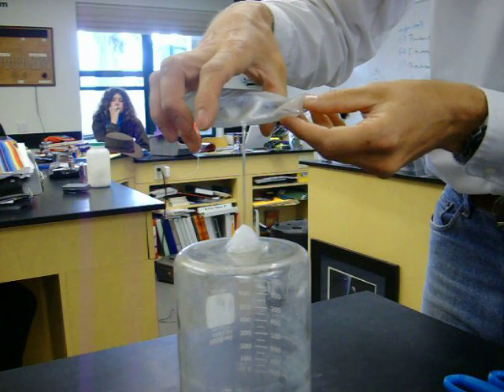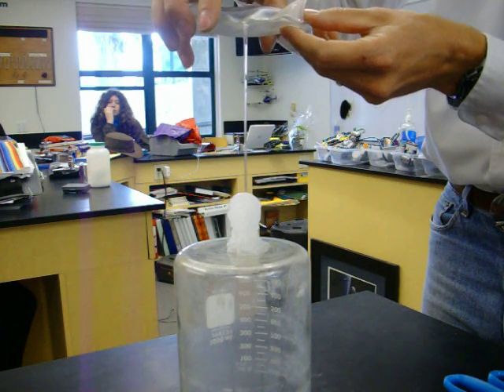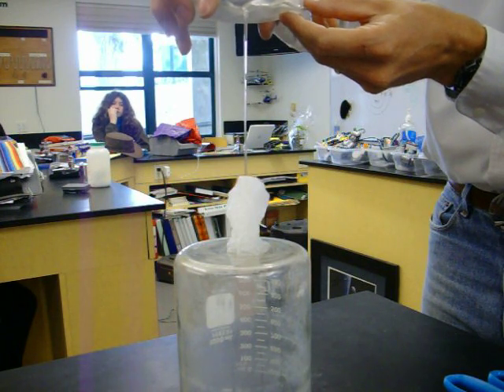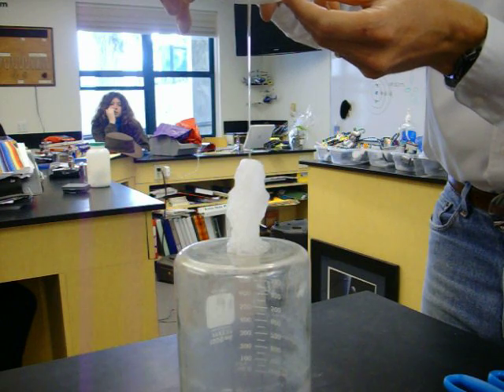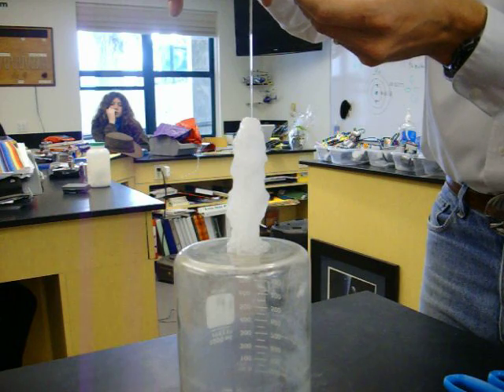And you can see it's instantly freezing. Isn't that cool? Now it's not actually freezing — it's just coming out of solution. But it looks like it's instantly freezing.